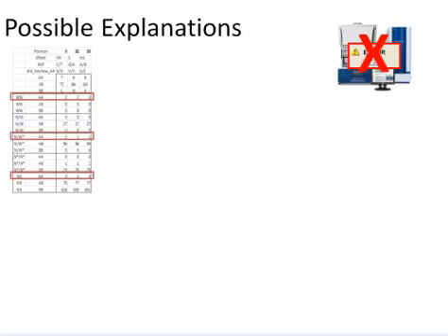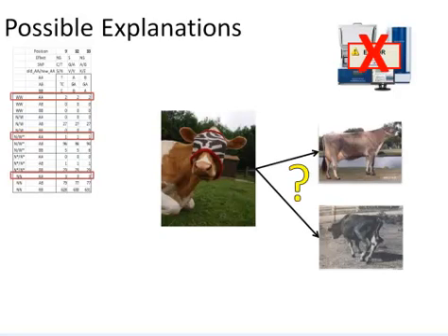We got the re-genotypes back. They genotype the same way. They're homozygous for that A allele. And looking at the signal strength, everything looked good, so we believe these are true genotypes. So another possibility was that these animals are misidentified. Either the wrong DNA got put into the wrong well, or these are animals that actually were affected, but something happened and they were harvested or they died before the syndromes showed themselves. Or it could have been that they had the disease, but it wasn't reported. This is a possibility, and we're looking into it.